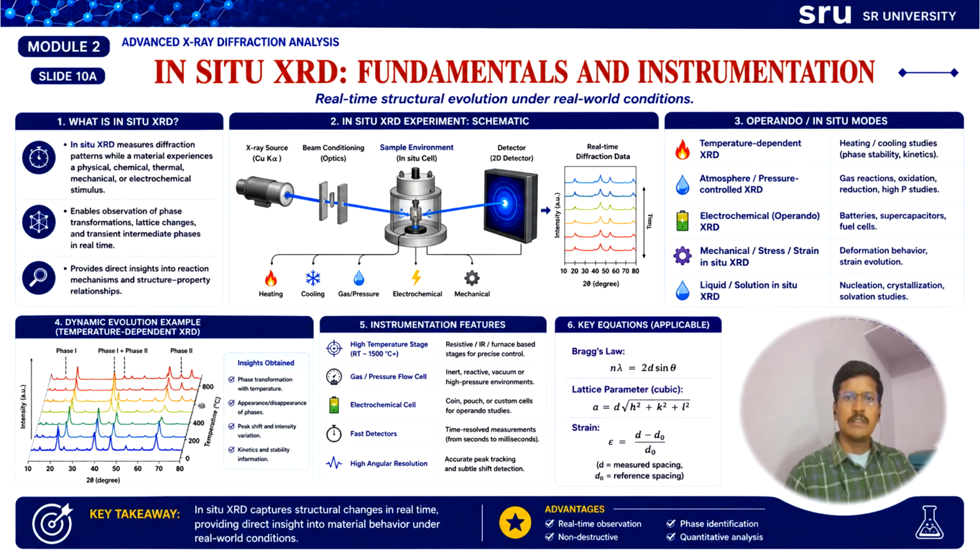So that during the experiment, the diffraction patterns are continuously collected while the materials undergo dynamic structural evolution. This enables the researchers to track phase transition, lattice expansion, crystallization, chemical reactions, and strain developed in real time.